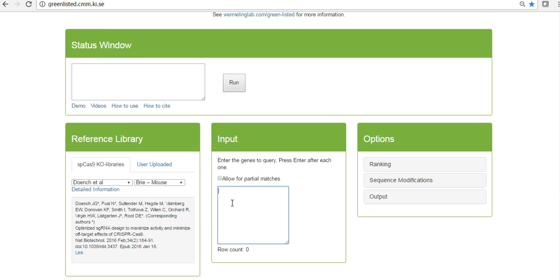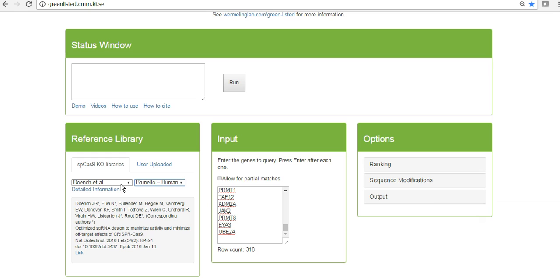So you go to GreenList. We input them here. Let's use the Doench Brunello library, which is a human library, coming from this reference here. The input is here.